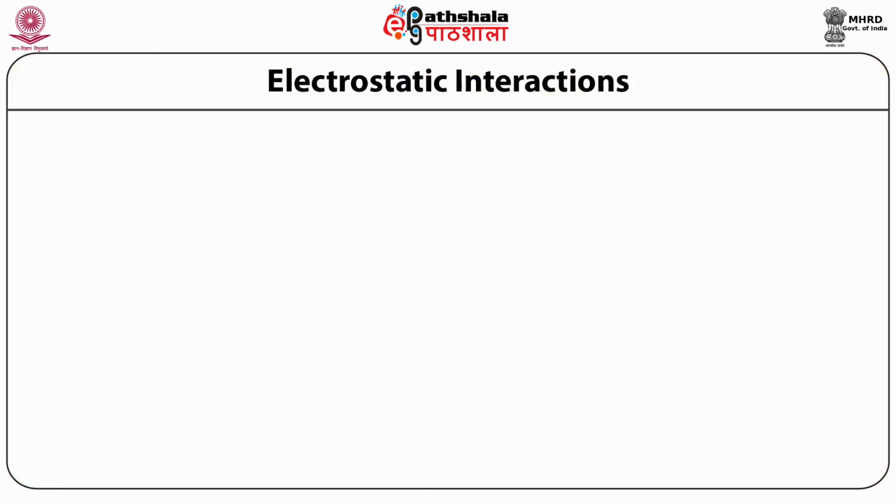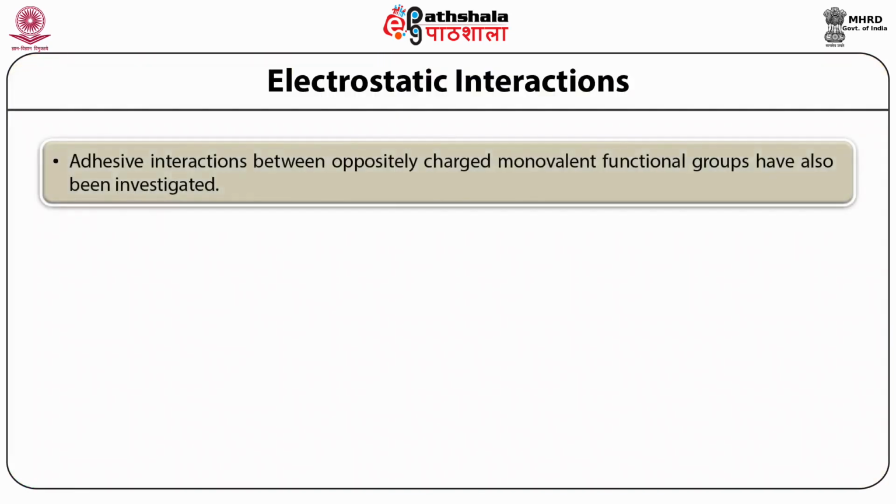Electrostatic interactions. Adhesive interactions between oppositely charged monovalent functional groups have also been investigated. The electrostatic contribution to the attractive and repulsive forces between charged surfaces has been studied previously using SFA and force microscopy.